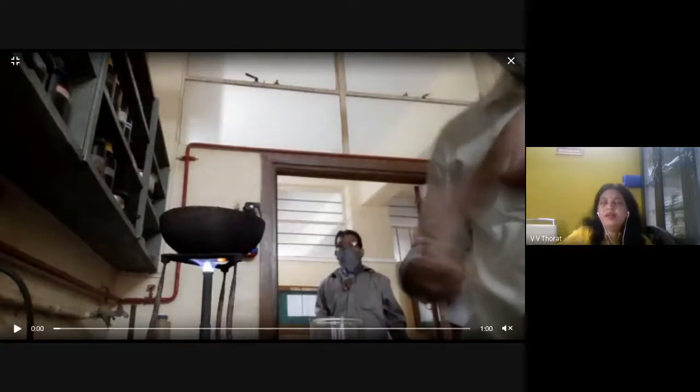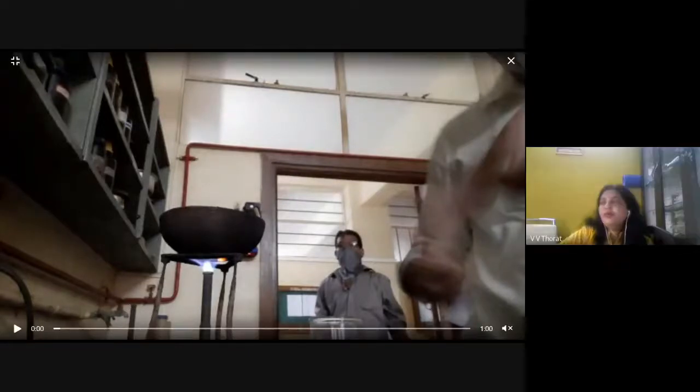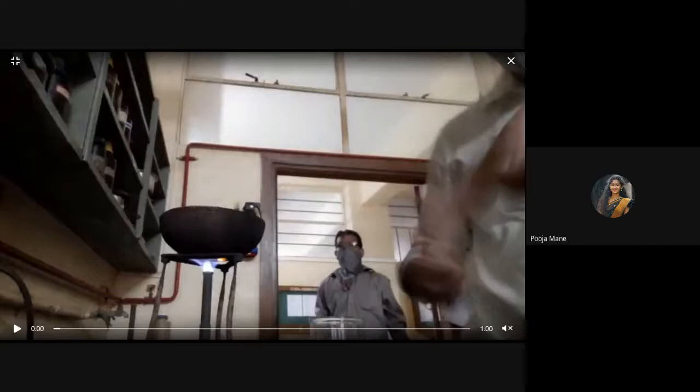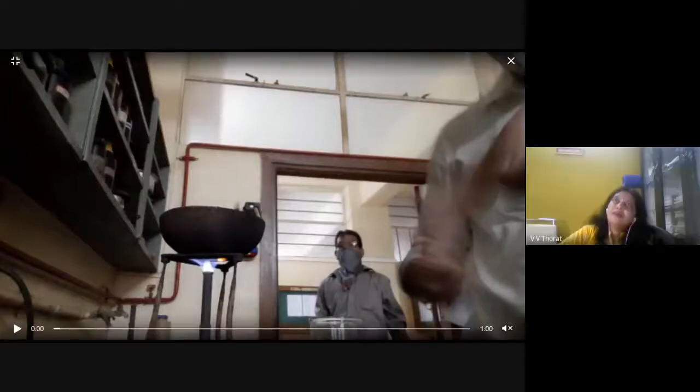Is it clear? Pooja, tell me. What did I tell you? How will we proceed now? Ma'am, before weighing, we should put the sand on heating, and the sand should be heated for 15 to 20 minutes. Yes. And then you will weigh, transfer it in a beaker, and add HCl.